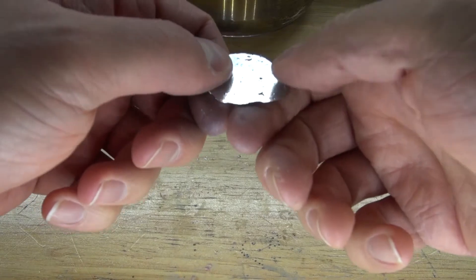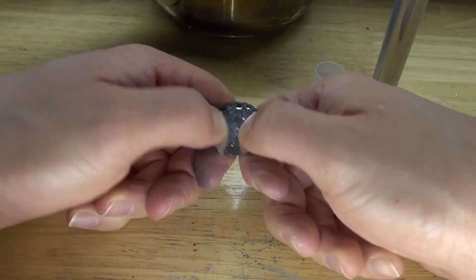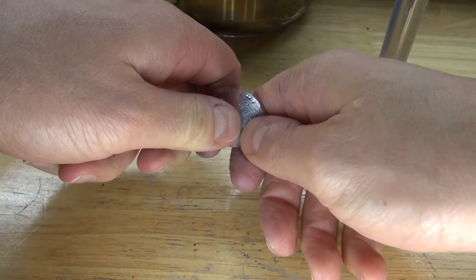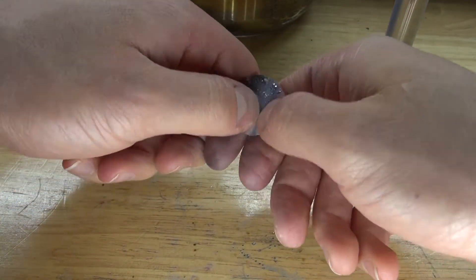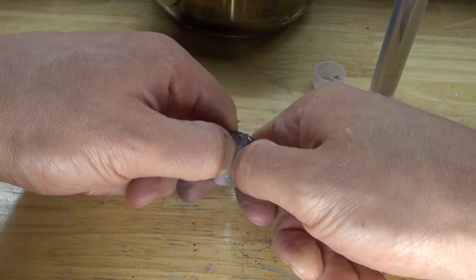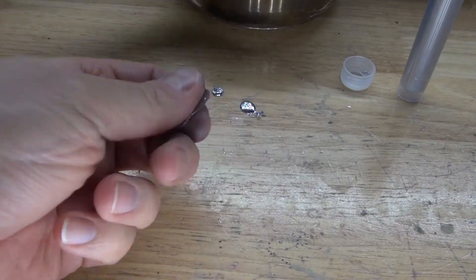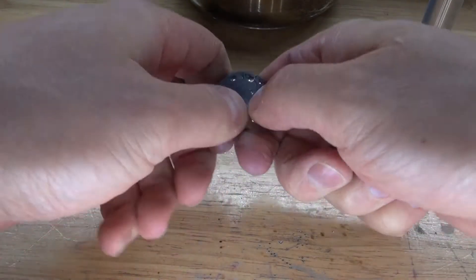Let's see if it crunches — oh, it's very strong. It doesn't crunch like indium does with the crystalline structure. And bismuth — that's a strong metal. Let's see how strong this metal is. Trying to bend it — it's very strong.